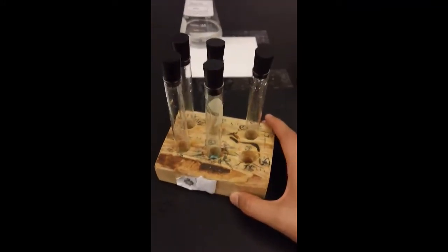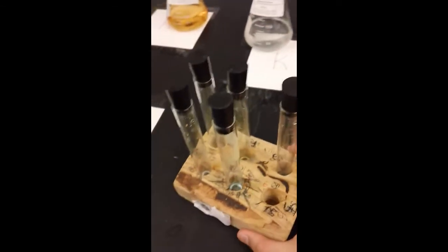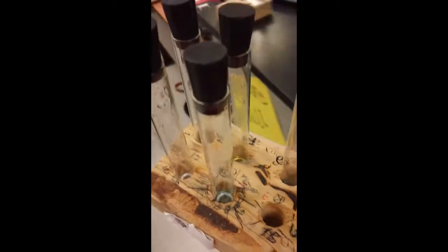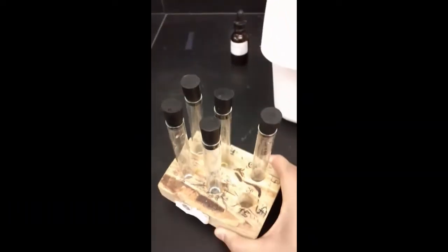All right, so now that I have my base, these are my 5 known chemicals, I know what each of them are, I'm going to go run test A on each of these chemicals and record down what I see. So when I run these tests, you need to write down in your notebook what you see. Let me go grab my lighter. Okay, so now I have my lighter. I'm going to be performing my flame test now.